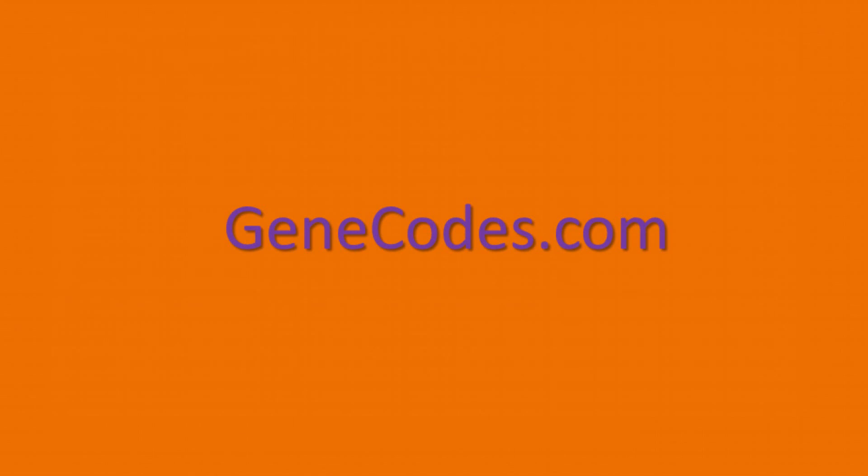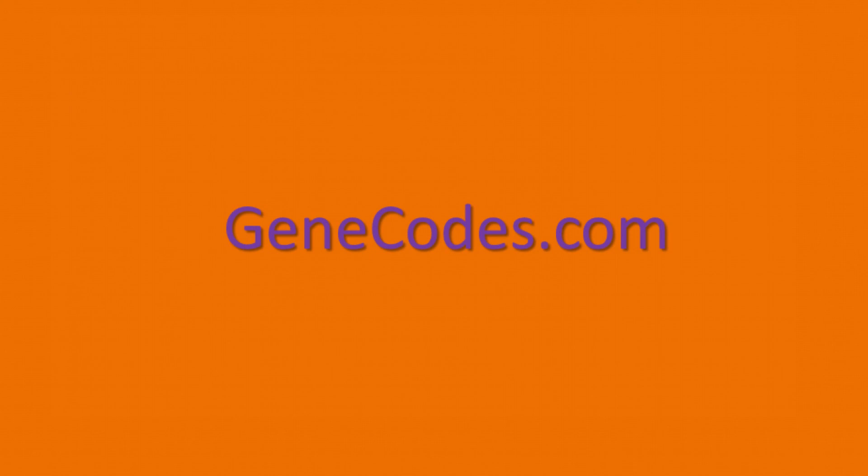This has been a brief introduction to the new features of Sequenture 5.3. Download Sequenture 5.3 at GeneCodes.com and request a 30-day evaluation license to try them out today.